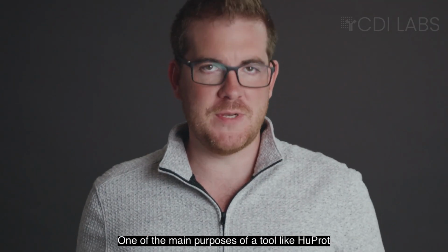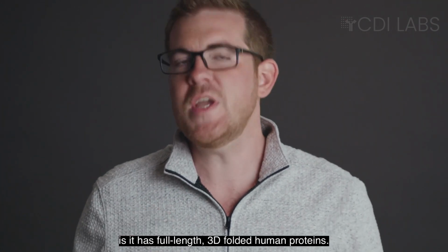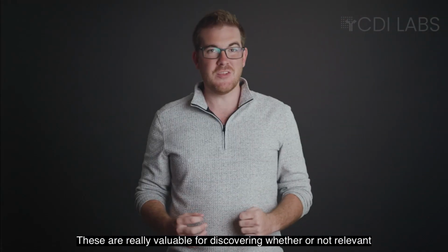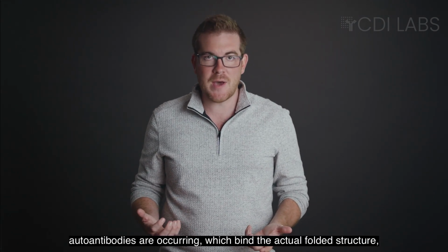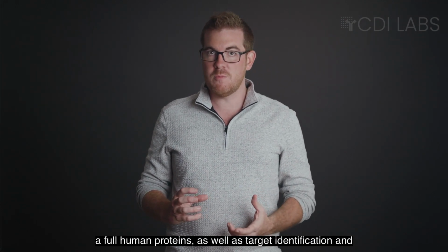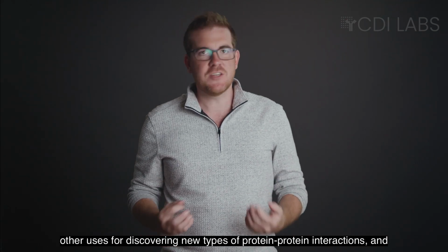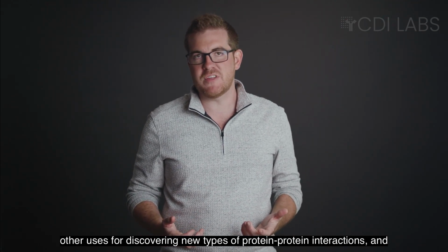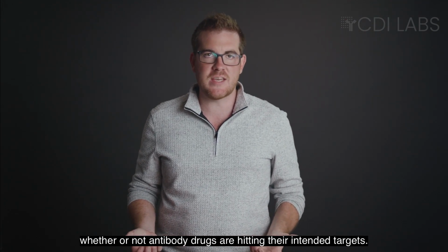One of the main purposes of a tool like HuProt is it has full-length, 3D folded human proteins. These are really valuable for discovering whether or not relevant autoantibodies are occurring, which bind the actual folded structure of full human proteins, as well as target identification and other uses for discovering new types of protein-protein interactions and whether or not antibody drugs are hitting their intended targets.